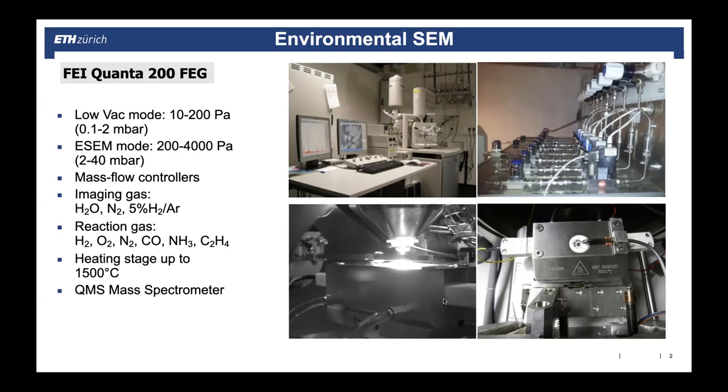So we built basically our own heating stage that works with a laser. So we use laser heating to heat up the sample from below, so that the light comes from below, heats the sample, and we observe with the secondary electrons, with a scanning electron microscope from the top.